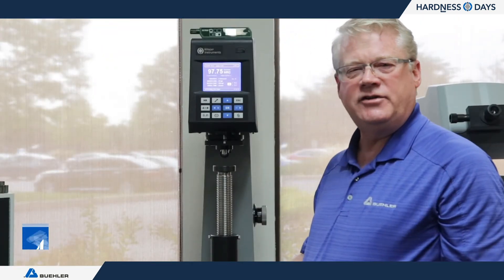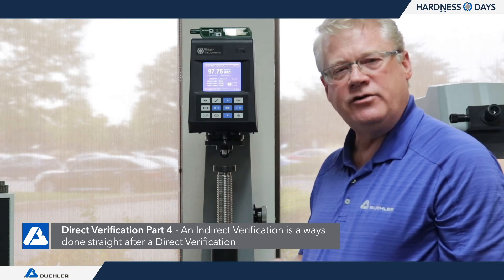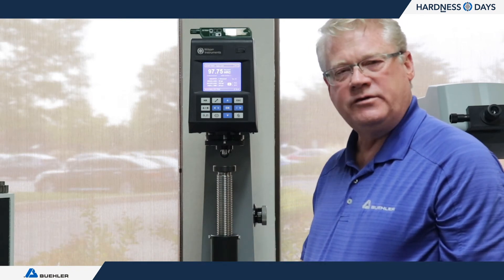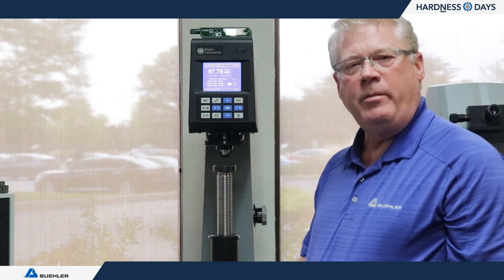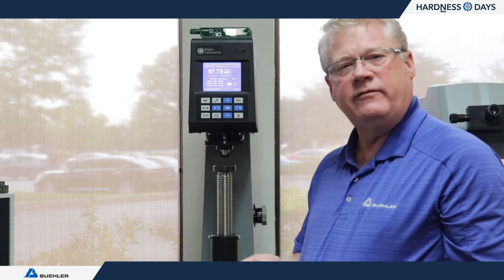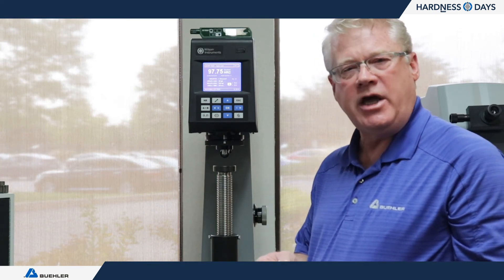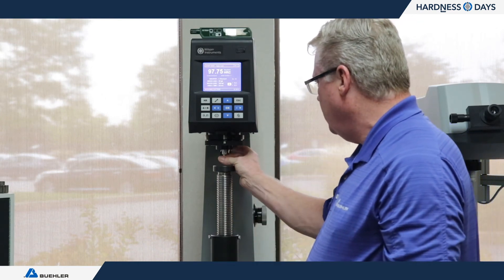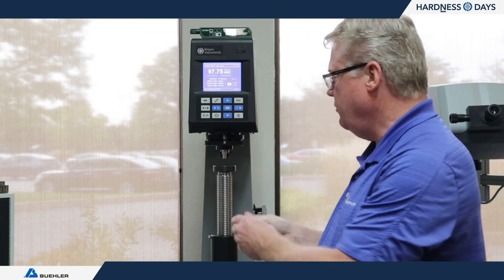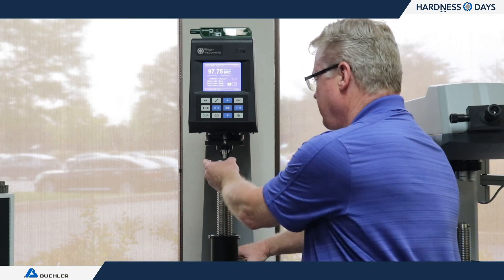The last section of E18 is: once all parameters have passed direct verification — hysteresis, forces, timing, and depth measurement — you must recalibrate all scales the customer normally uses, with 3 test blocks per scale and the customer's standard indenter. The process is the same as before, repeated to show the machine is still maintaining compliance.